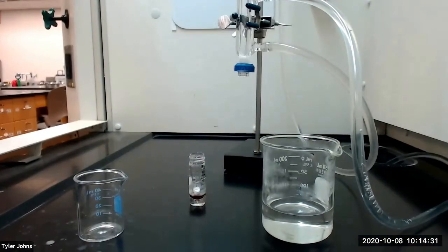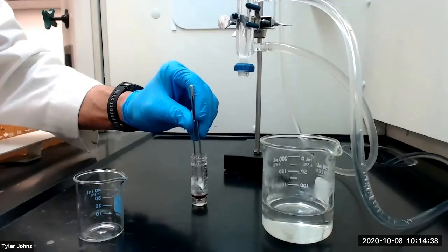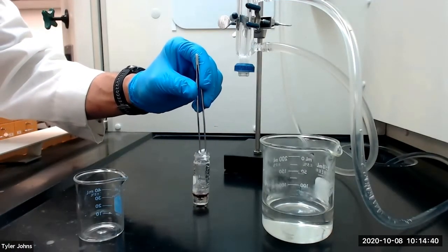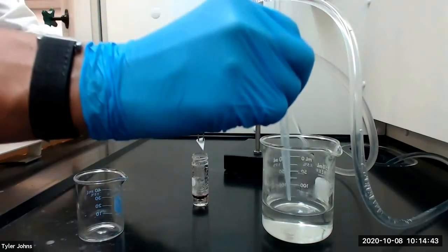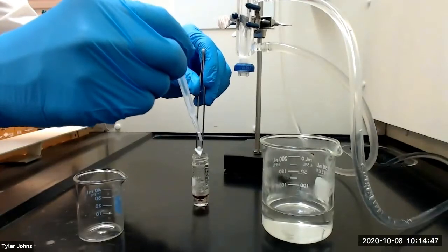We're going to remove the spin vane with forceps and rinse the spin vane with several drops of warm deionized water back into the conical vial.